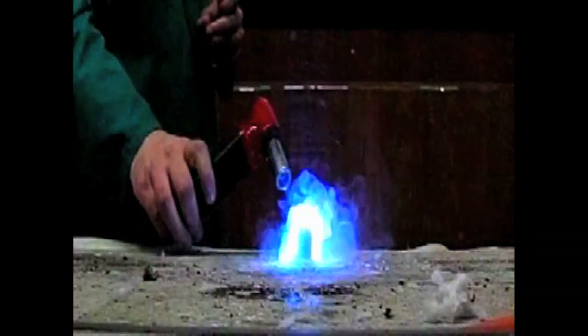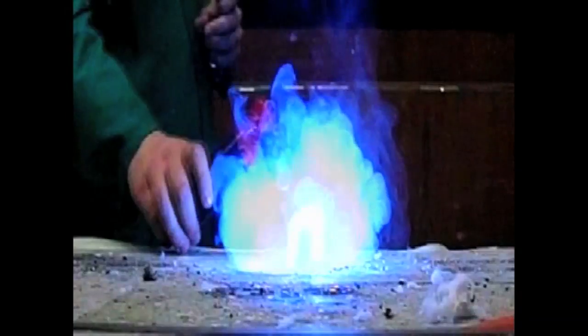Now that was great - a lovely blue flame from that copper chloride. Wasn't that really fantastic? That was brilliant!